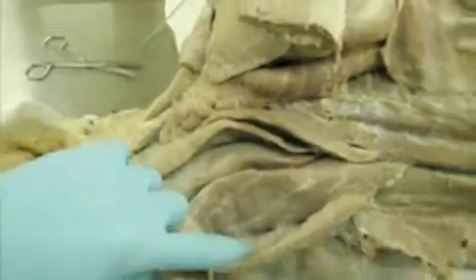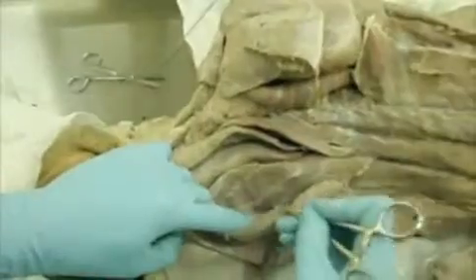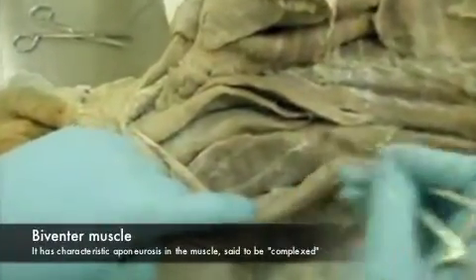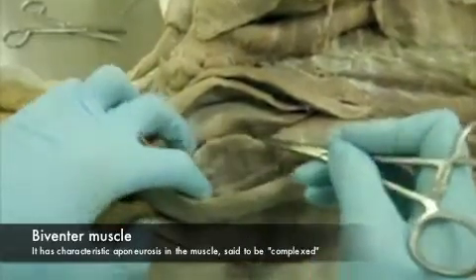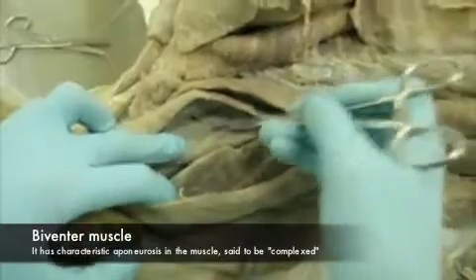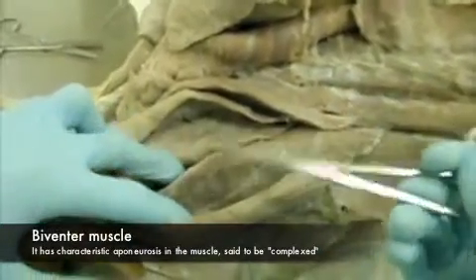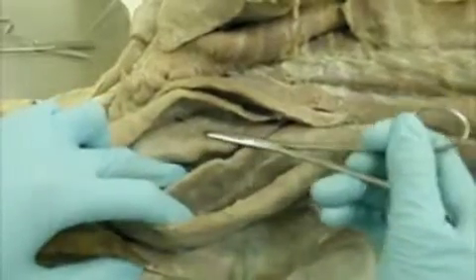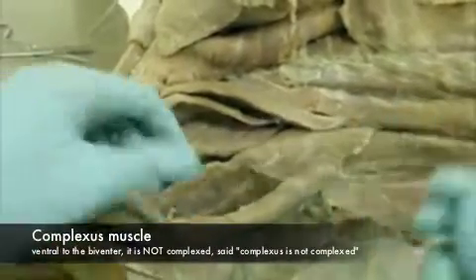You know this is your biventer because it has very characteristic aponeuroses in the muscle. Can you see that? It's like these thin white streaks in the muscle. So that's your biventer. And then next to it is your complexus. So the way I remember it is the biventer is complexed. Sorry, did I mix that up?